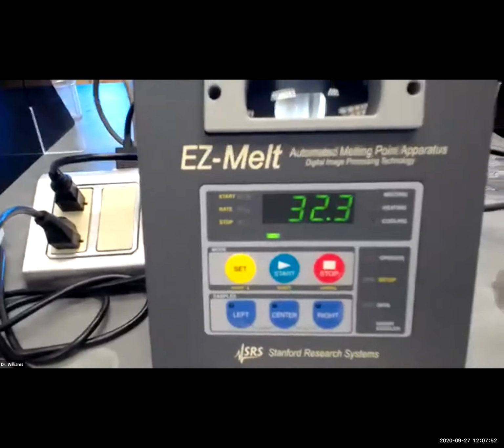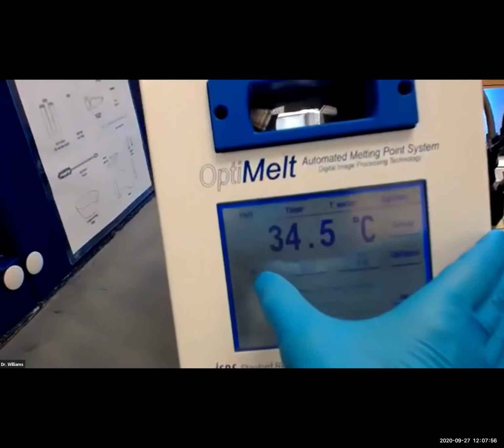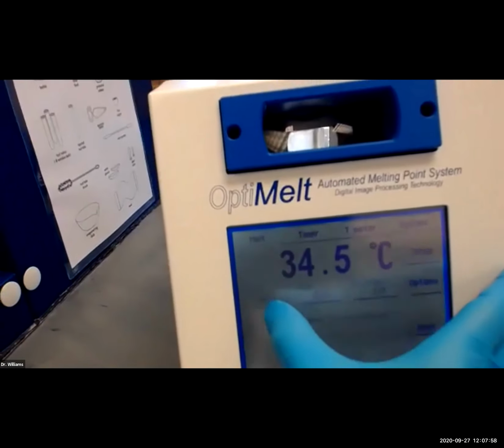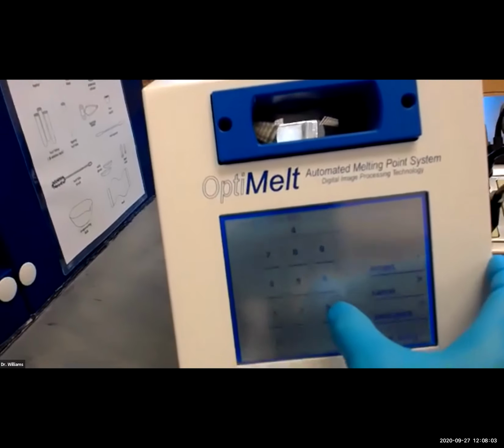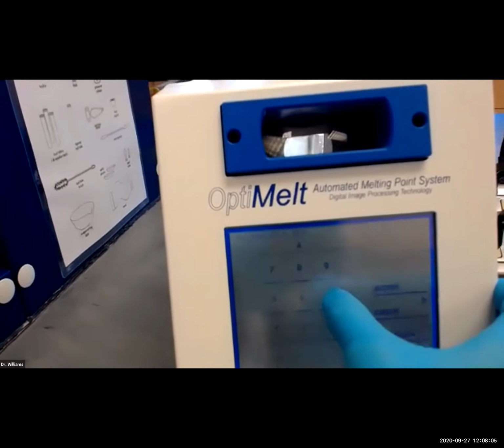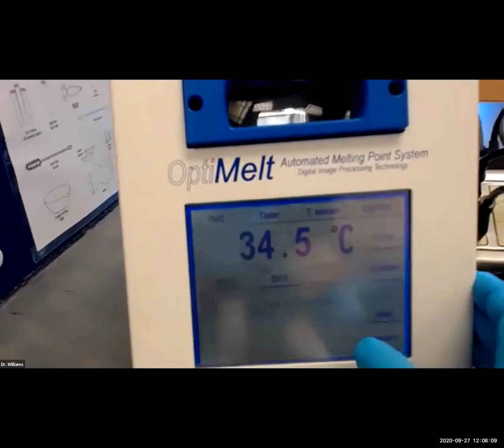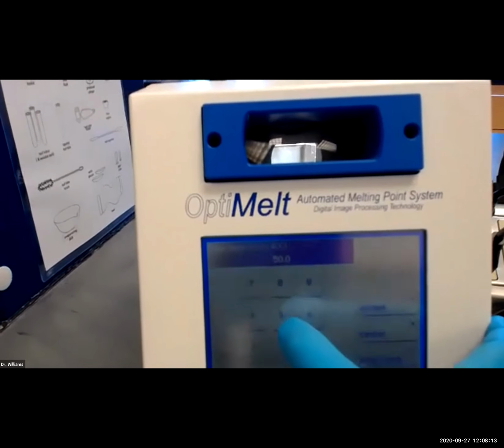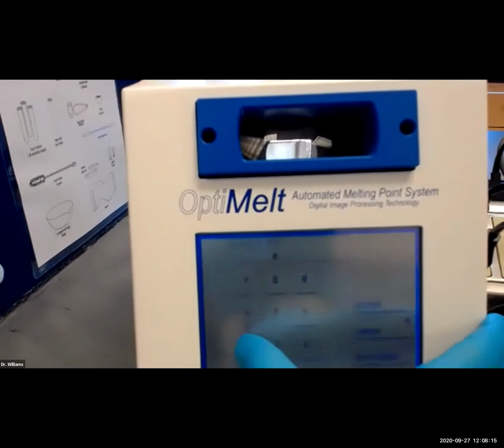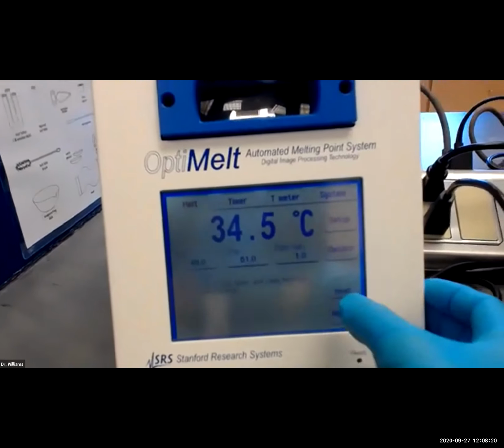I'm going to set the temperatures on the other one just to show you. It's really easy, right? So you're here, you look over here, it says start, press this one, and you just enter it. I think it said 47, or 46, excuse me, 46, accept. You can see that, good. And the stop temperature, we said it's going to be 61, accept. That's good to go. Now we simply press the heat.